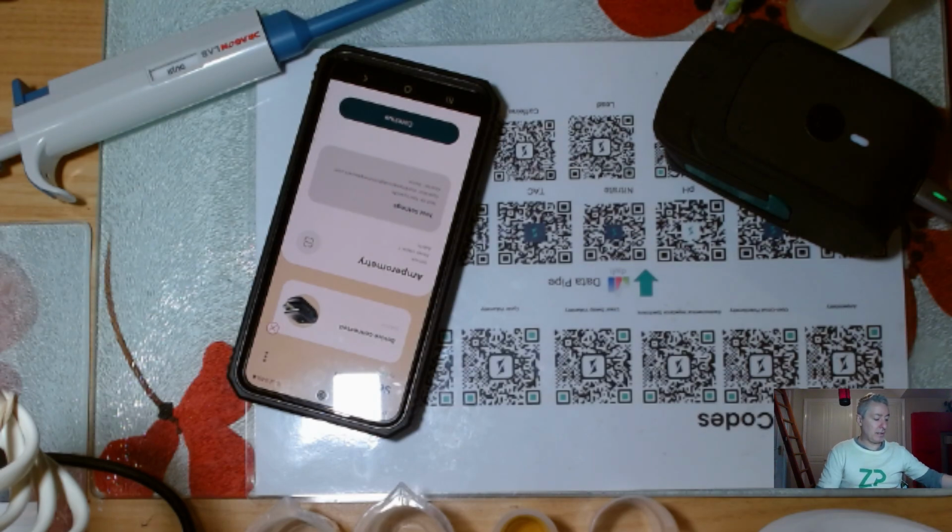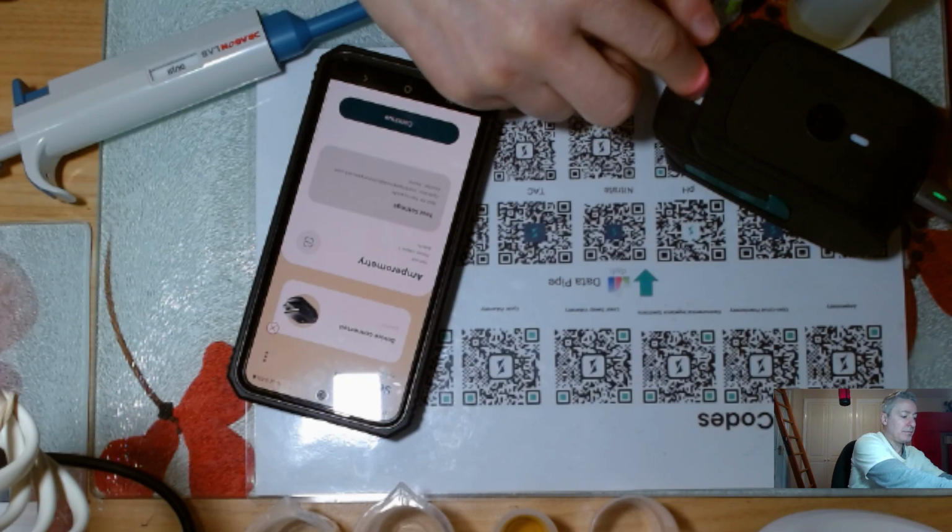I'm just going to grab a clean sensor because the person asking the question has sent me images of screen-printed electrodes and sensors and stuff. So I just want to say, the images you're sending me, here you are. Right, I'll take one of those. I'll put it into the potentiostat.